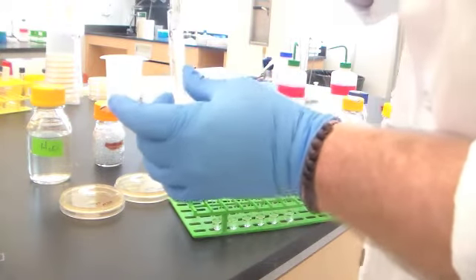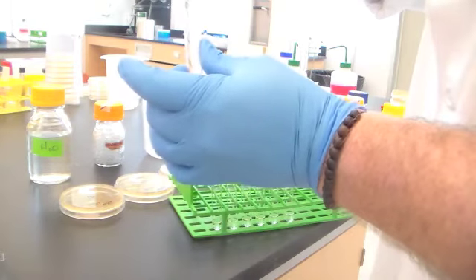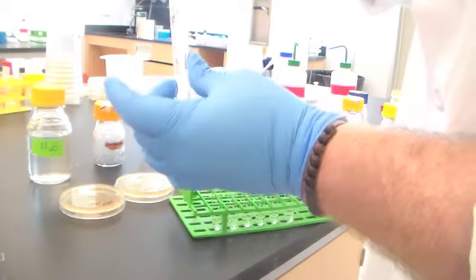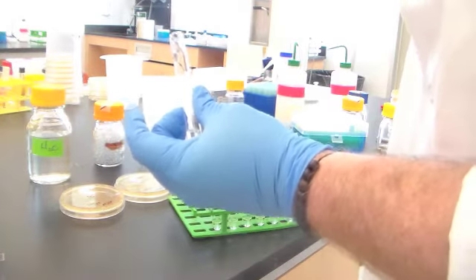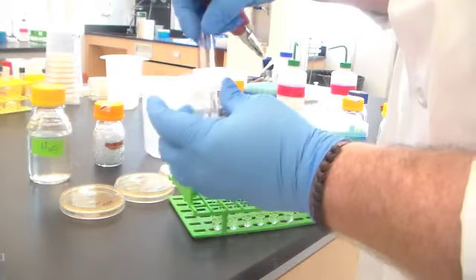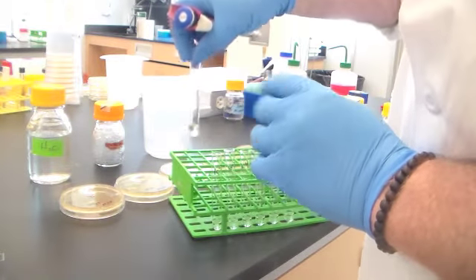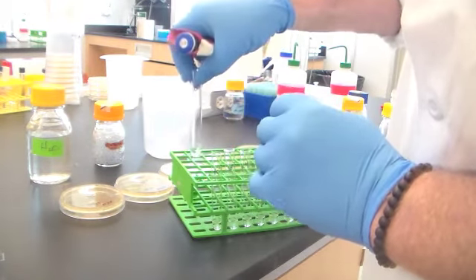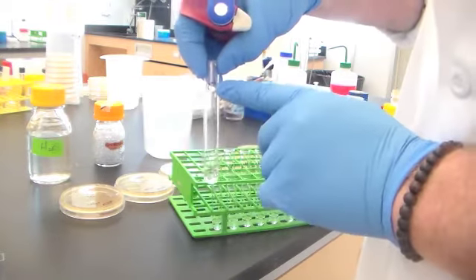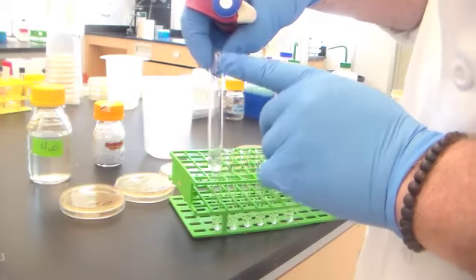And then I'm going to triturate, or pipette back and forth, to rinse the bacteria out of that. I go down to the second stop to make sure I've gotten rid of the last drop. I pull that out, and now very importantly, I get rid of that pipette tip. It's very important that you change pipette tips between every one of these dilutions. This is your 10 to the minus 1, or 1 to 10, dilution.